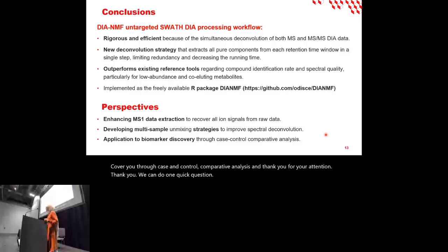Thanks. I'm curious, for your method, does it apply to the DDA experiment as well? Or for the DDA, is co-eluting not a severe issue?